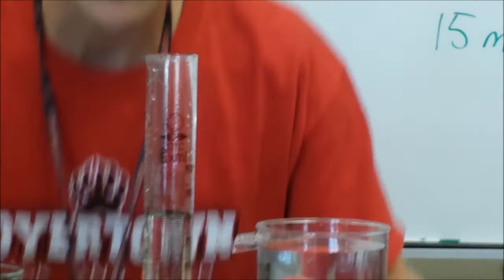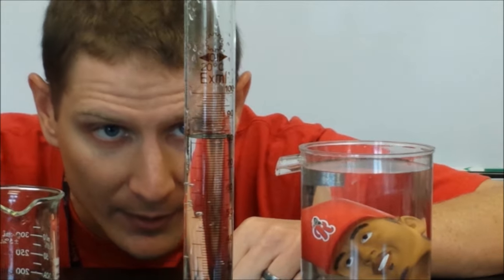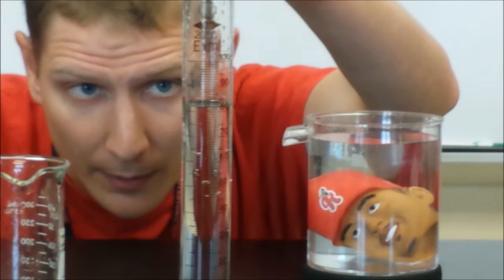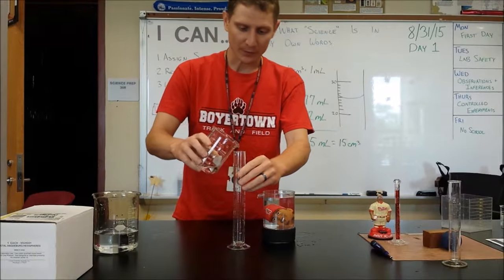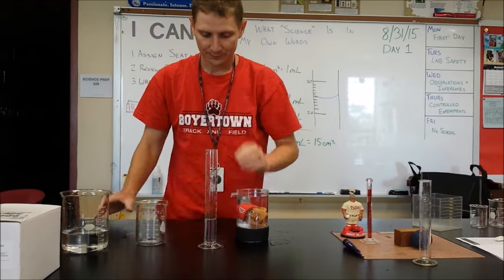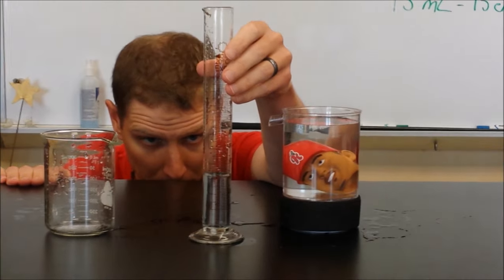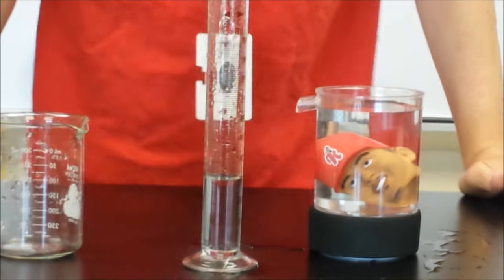Okay, so again, we're going to get eye level with it. We're going to read the bottom of the meniscus. And that looks like it's at 81 milliliters. Now I can discard what's in my graduated cylinder. So I'm going to place it back into my large beaker. I'm going to fill up the rest of the way with what we have from Jimmy Rollins' head. Take our second measurement. Looks like it's about 31 milliliters.